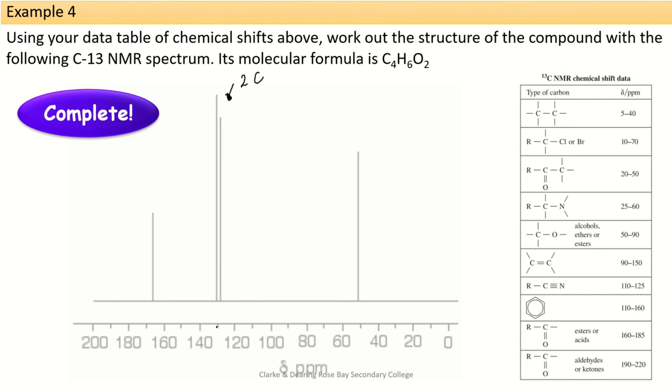So if we look at this chart from 120 to 140, whichever one matches, so 120, it could be this one here, or obviously it could be one of these two, but we firstly don't have nitrogen, so that's not possible. And this is a benzene ring, which needs 6 carbons, that wouldn't fit either with our structure here. So that means the structure we have here is the carbon-carbon double bond. So we need to put that in at some point.